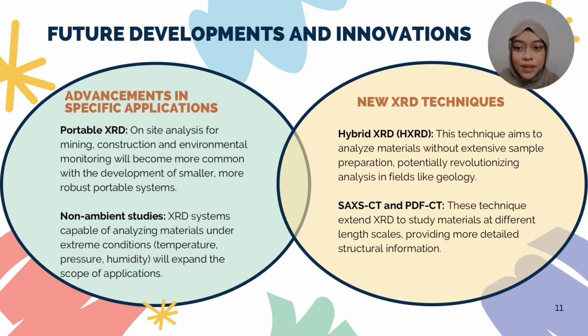Next, advancement in specific applications. Portable XRD, on-site analysis for mining, construction and environmental monitoring will become more common with the development of smaller, more robust portable systems. And non-ambient studies, XRD systems capable of analyzing materials under extreme conditions like temperature, pressure, and humidity will expand the scope of applications.